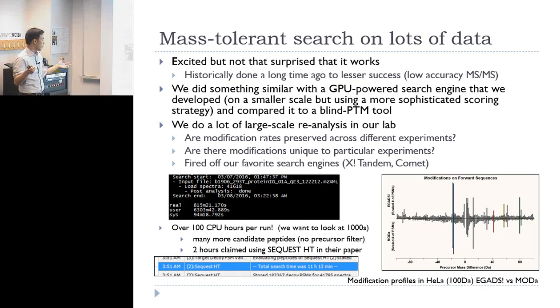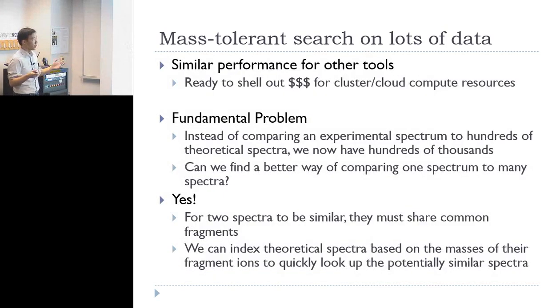In the paper they claimed they only took 2 hours on their machine. So we ran it on one of the computers in the pathology proteomics facility, which actually has proprietary software, and it took 11 hours. They could have some specialized modified version of the tool, but we don't have access to it, and we tried a whole bunch of different tools, and they all took a long time.